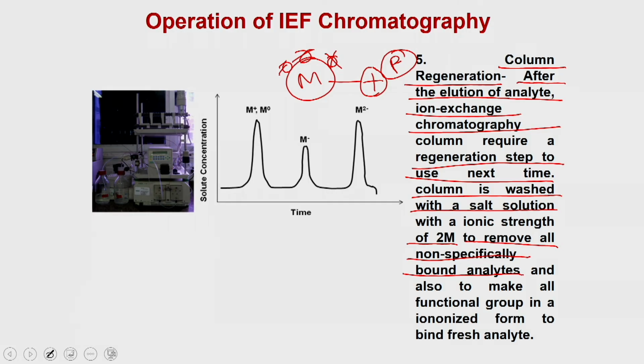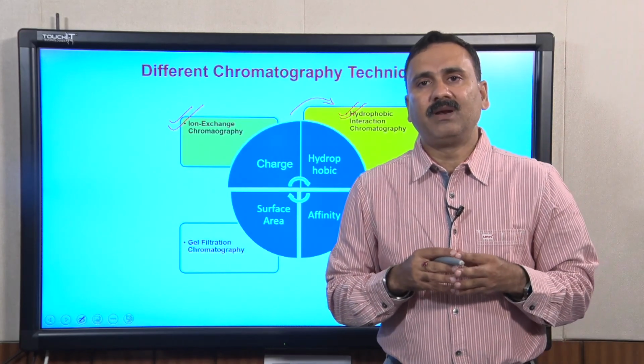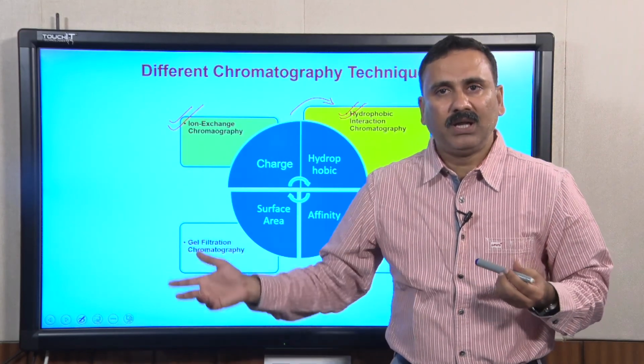So, that will remove the non-specifically bound analytes and also make all functional groups ionized to bind the fresh analytes.